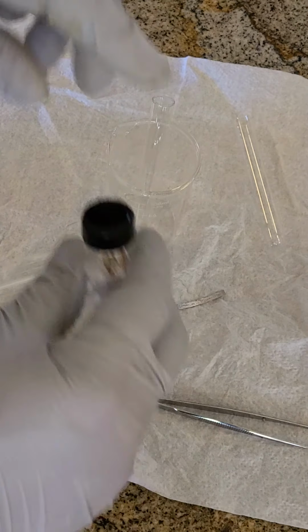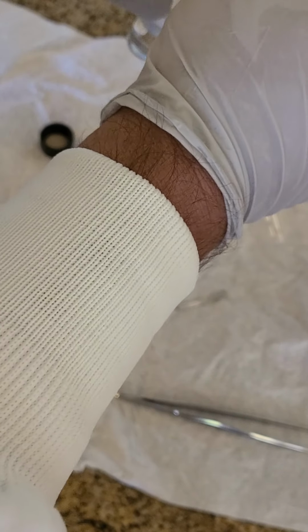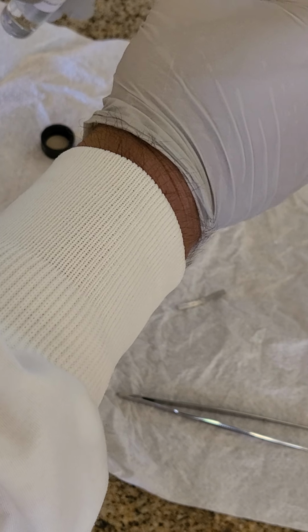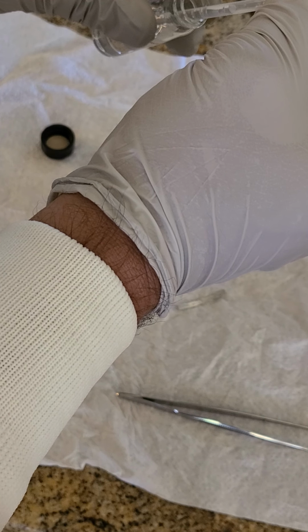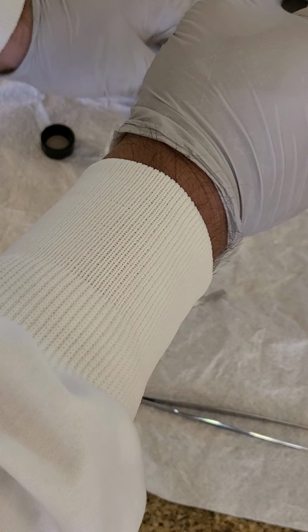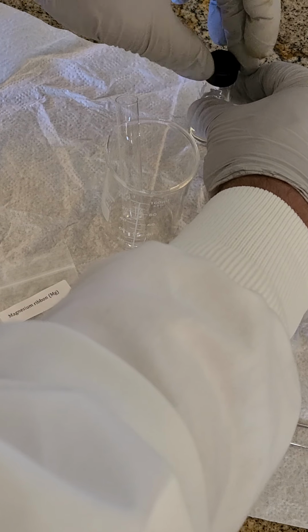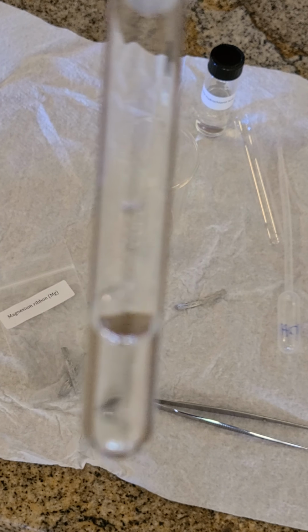I would make sure to lay down a paper towel, because you don't want to spill HCl on any surface. It will eat that away. And again, this is qualitative. I'll fill it up to that mark twice. Then I'll discard, and you'll notice that it's stinky. That's normal. Fill it up again. Man, this one's really stinky. I've got to close this up soon, because I don't like the smell. I was always good in lab, but there are certain things I didn't like in lab, and one of them is stench. So go ahead and close that up. Now I know that's sealed, and my test tube has roughly 2 mls.